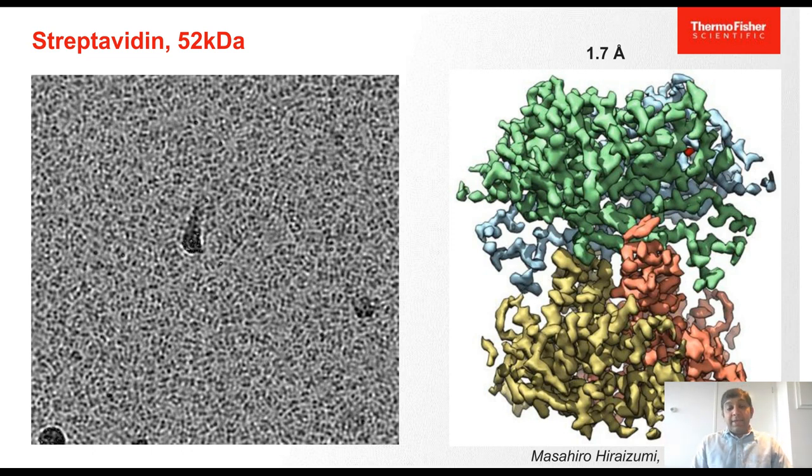Now this is even more exciting, that we can further, even after the grid was sitting in the microscope for some time and was transported, published a paper with LMB Cambridge on atomic resolution structure of apoferritin, as well as a 1.7 angstrom structure of a human GABA receptor. There, with the GABA receptor, we saw that at 1.7 angstrom, we can actually see hydrogen atoms.